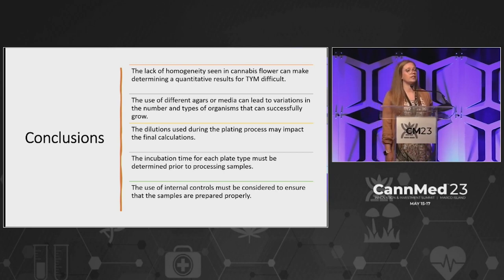And then the incubation time for each plate type must be determined prior to processing samples. All laboratories really need to go about this process. They need to take whatever plate type they're using, and you need to let it grow. See what happens. Establish that true incubation time. Truly validate when those samples are ready to come out of the incubator.